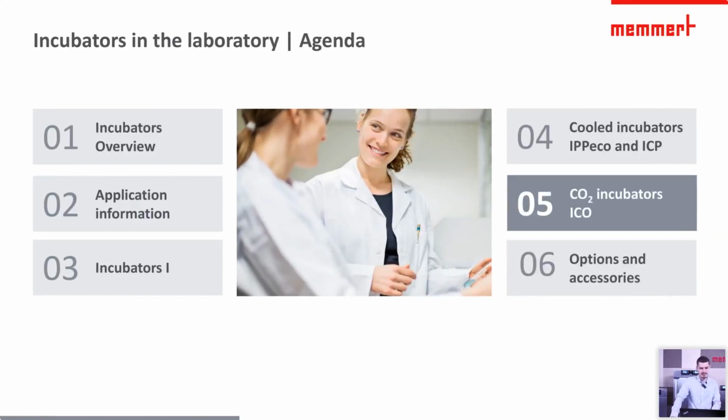Last but not least, the CO2 incubators. There are 2 basic requirements for a CO2 incubator. Firstly, the CO2 incubator must be able to control the temperature and CO2 concentration as accurately and stably as possible to facilitate the research process. Secondly, the CO2 incubator must effectively prevent microbiological contamination within the incubator and regularly remove any contamination to protect the research results and avoid sample loss.